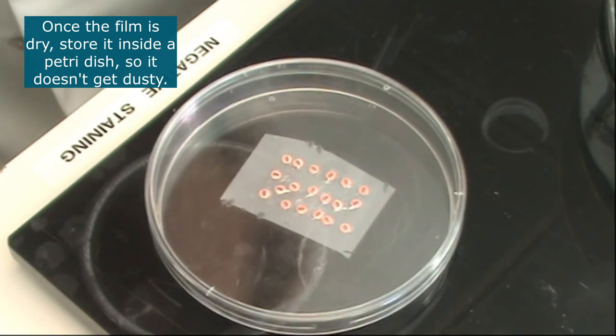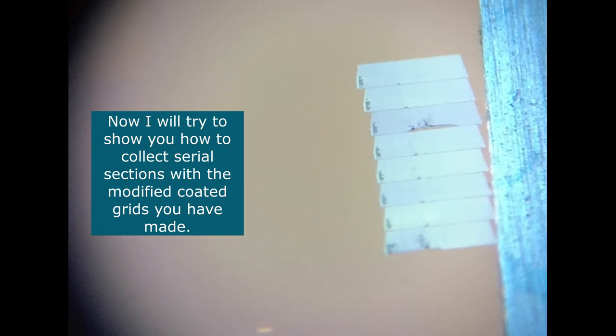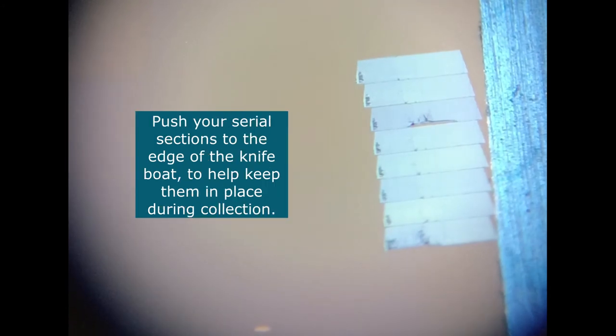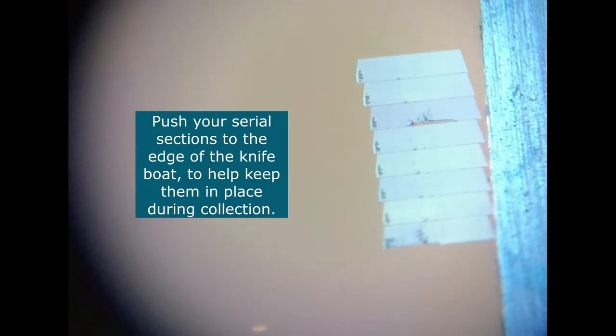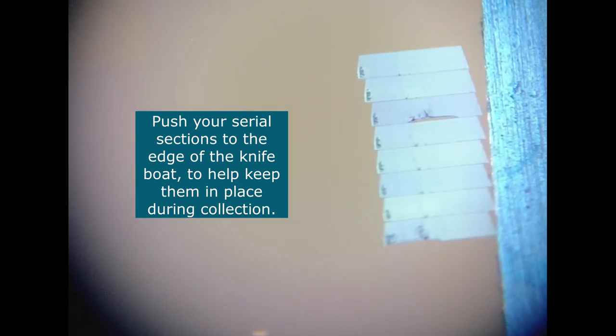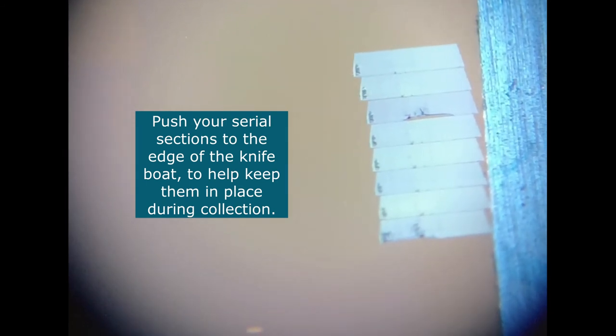Now I'm going to try to show you how to collect serial sections using the special grids that we made. First of all, you need to place your serial sections on the edge of the knife boat just so that they are kept in place.